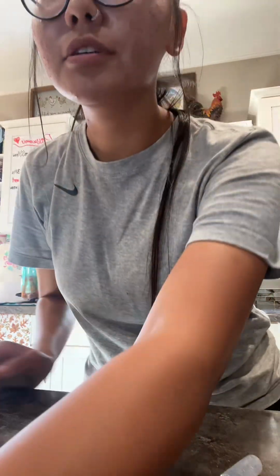In this experiment, you will be modeling the diffusion of a substance, cornstarch, across a semi-permeable membrane, the sandwich bag, to detect where the starch has traveled. We will use the indicator iodine. Iodine will turn black in the presence of starch and will be your indication of where the starch is. In other words, your results will be where the color changes, blackening happens.